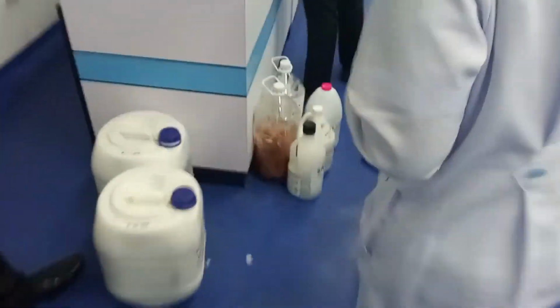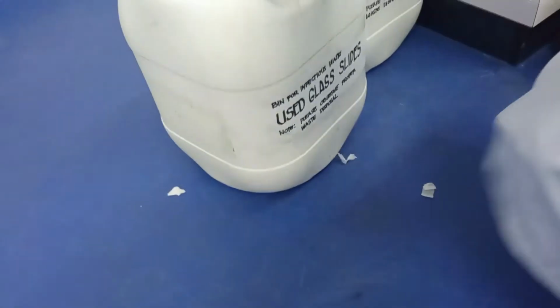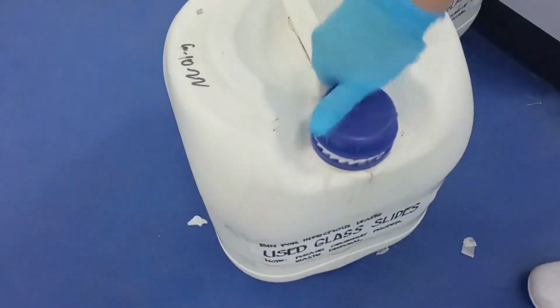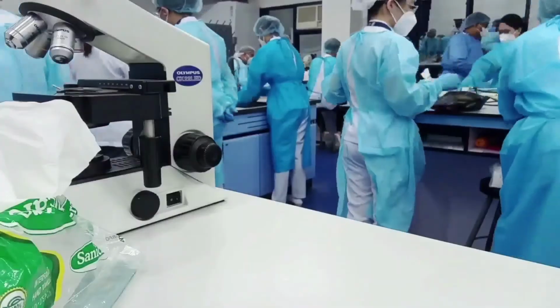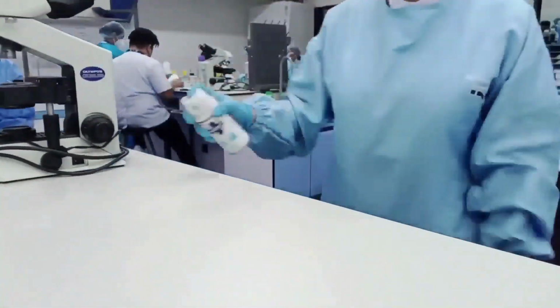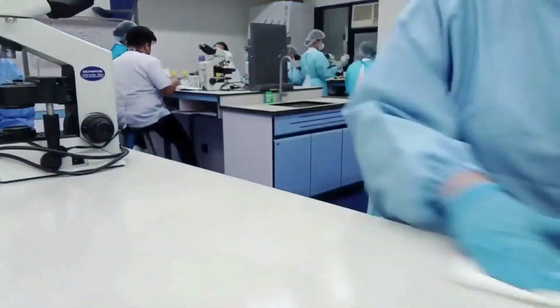After the procedure, make sure to dispose all the contaminated and soiled materials in the proper waste bins. Do not forget to disinfect your working area after using it.